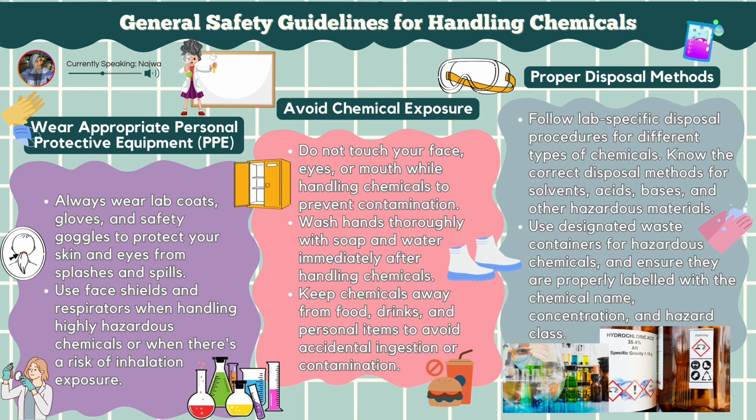Firstly, wear appropriate personal protective equipment (PPE). We need to always wear lab coats, gloves, and safety goggles to protect your skin and eyes from splashes and spills. Use face shields and respirators when handling highly hazardous chemicals or when there is a risk of inhalation exposure.